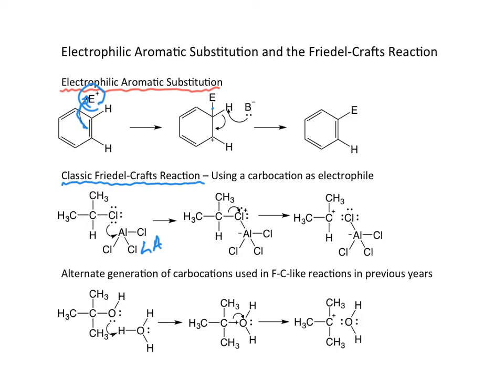In some ways, it's analogous to what we've done before. That is, we can use, and my positive charge is not showing here, but I will replace that, we can use a hydronium ion as an acid to protonate our oxygen to make it a better leaving group. We can see the positive charge sort of is hidden there. And then when the leaving group leaves, we can get a greater yield of our carbocation.